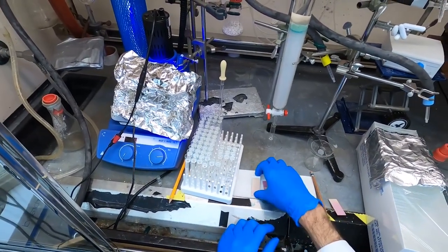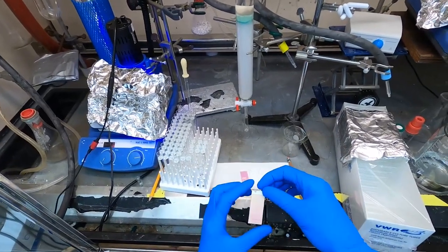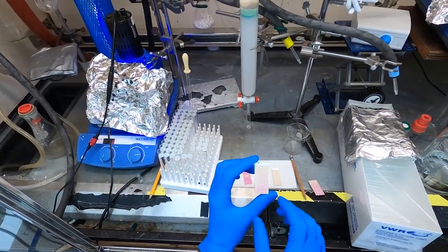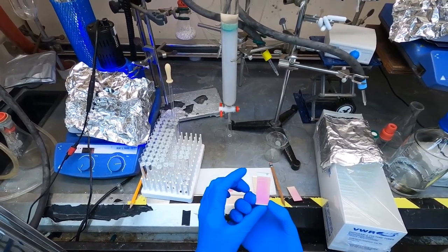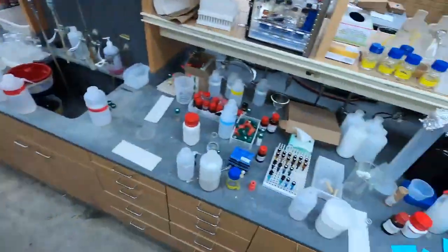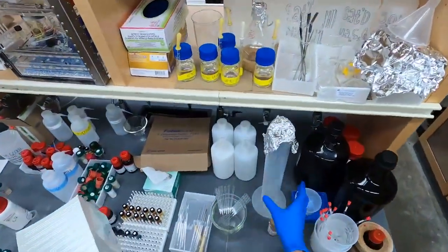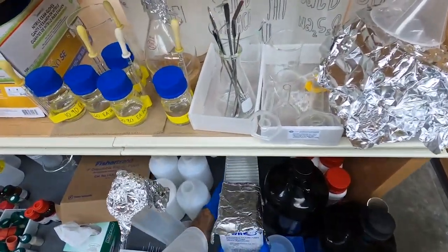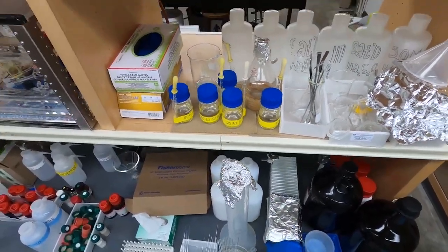And so then I actually ran one of the plates at 30%, and sure enough we can see those spots in rows about 8 through 11. And so that's what we'll focus on collecting. It looks like our 30% ethyl acetate and hexane worked really well. We got some really good separation there.